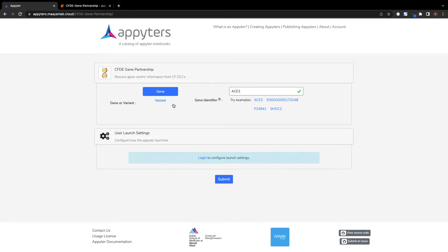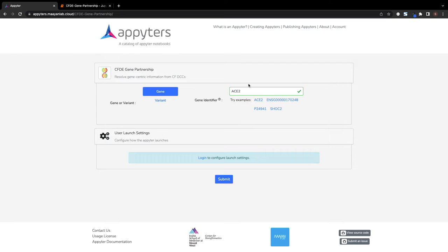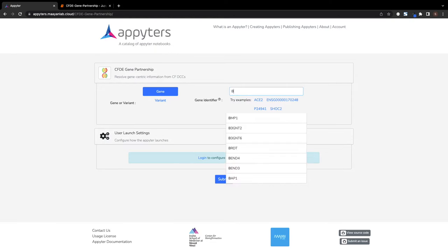From the home page of the Appyter, users can input a single gene or variant of interest. Currently, the Appyter supports all human genes.